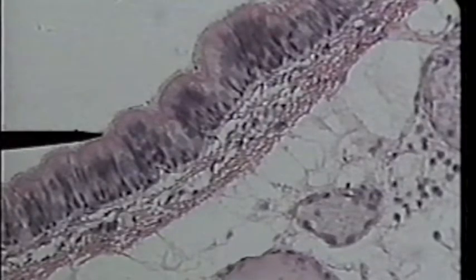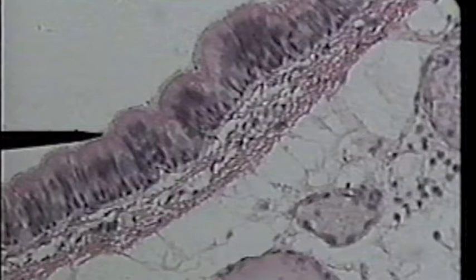Here, the tip of the pointer is on a layer of cilia on the apical surface of this pseudo-stratified epithelium. It has a fringe-like appearance, and you can recognize it as cilia.